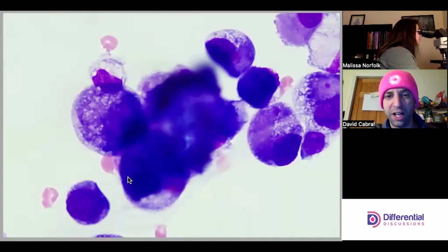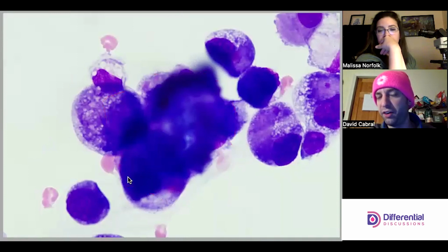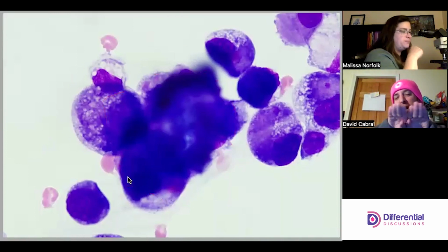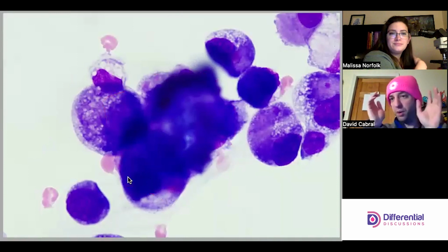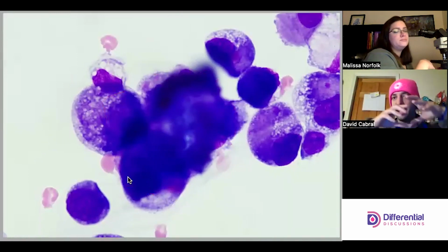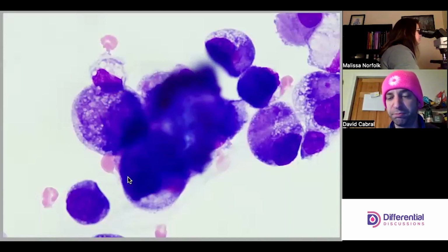So this is the kind of blobbiness that I want everyone to be vigilant about, because that's generally not normal in my experience. It's not just junk. It's the rest of the blob. If you think about where I talked about them being in sheets, now imagine that the contact inhibition is totally out the window, and then these things start growing this way. You get a verticality and the horizontal element, you get this kind of visual appearance.